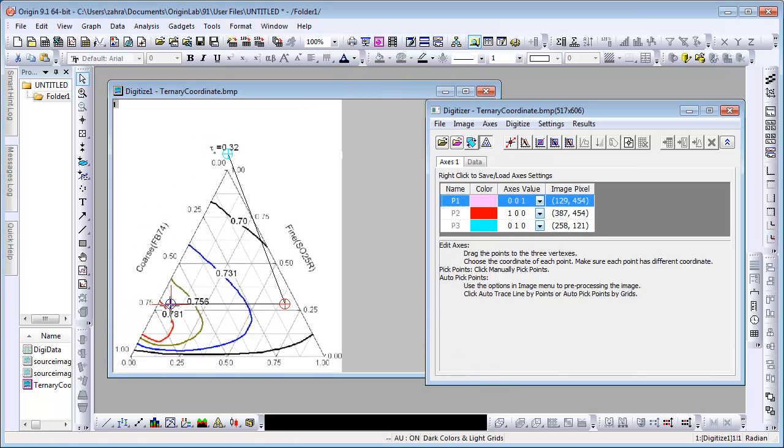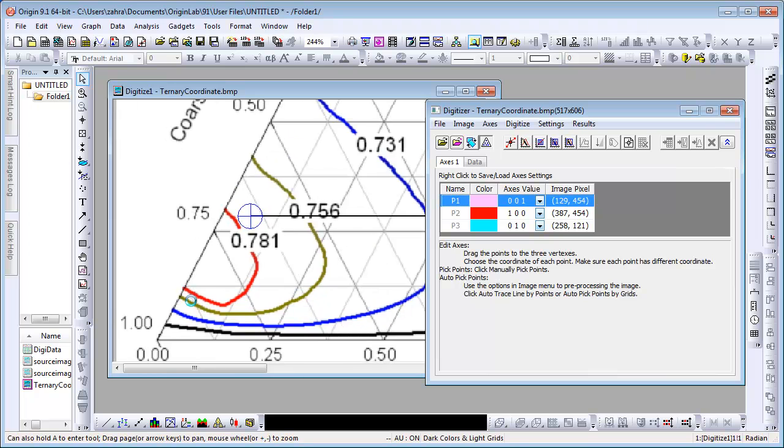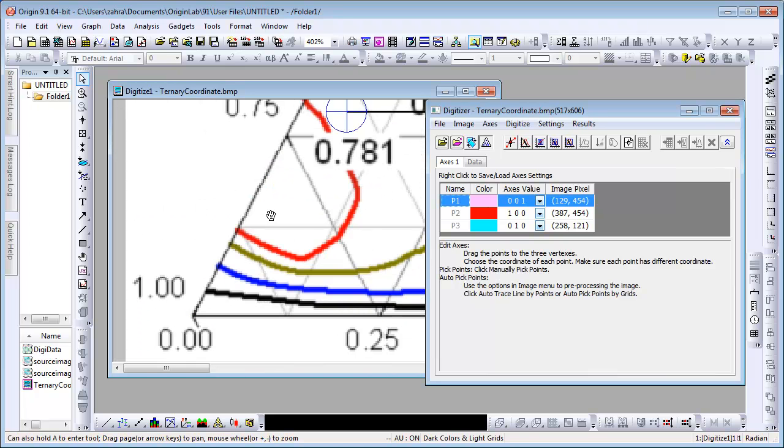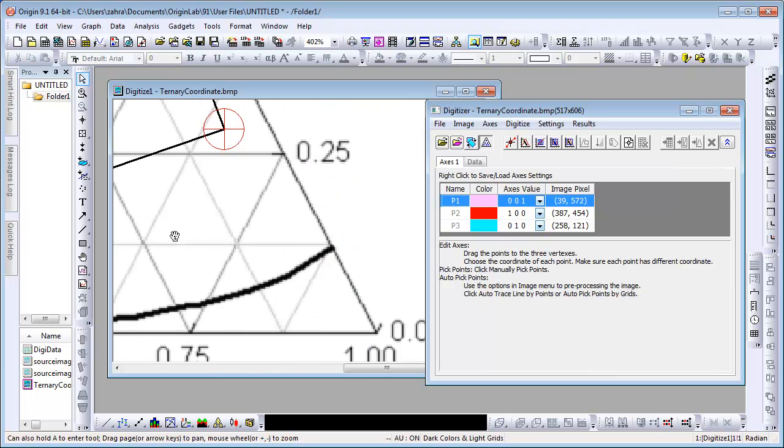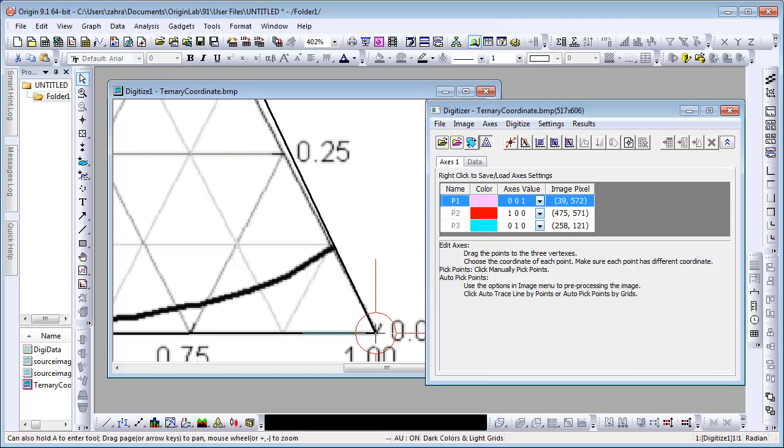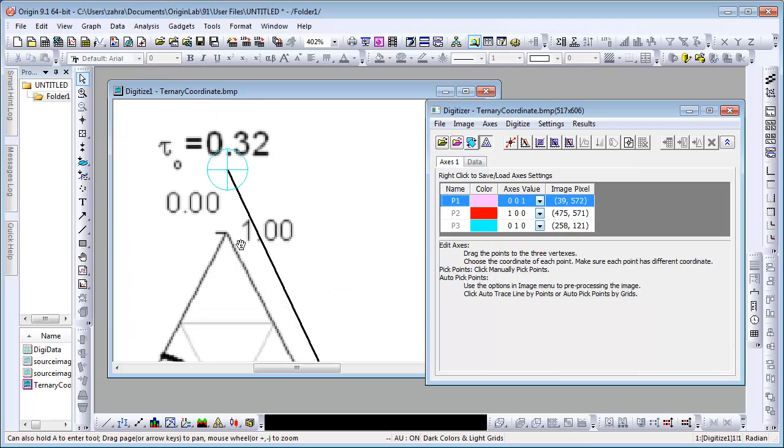Once again, zoom in for precision using A and use Tab to go from one point to the other while maintaining the same zoom setting. Once you are done setting the three points, Ctrl-W out to the original size.